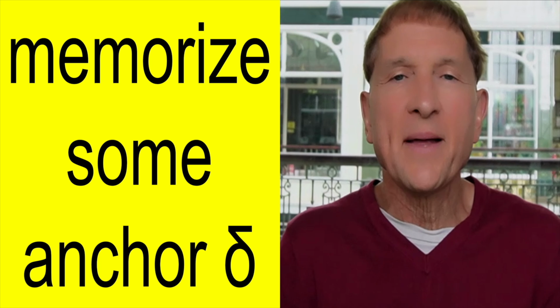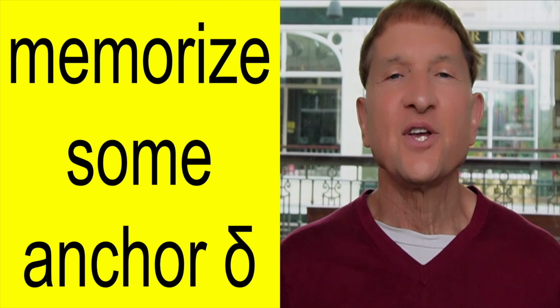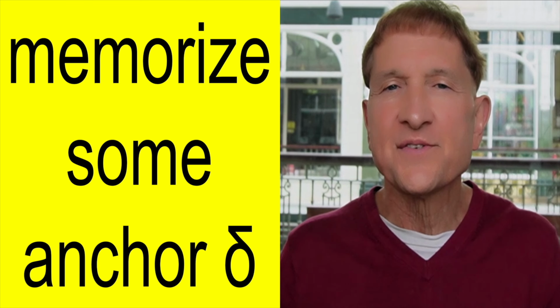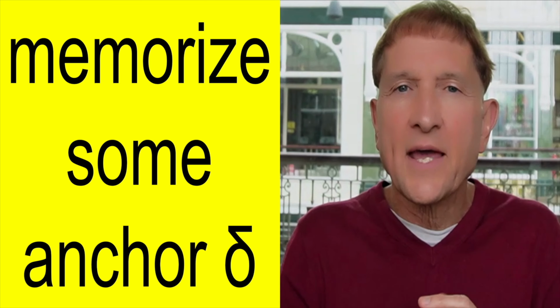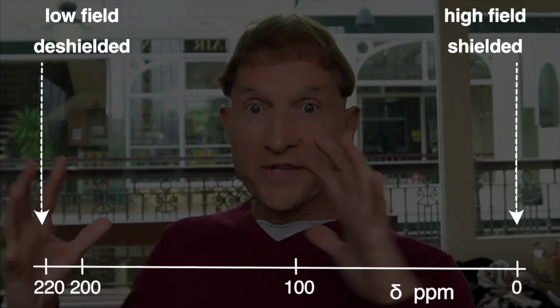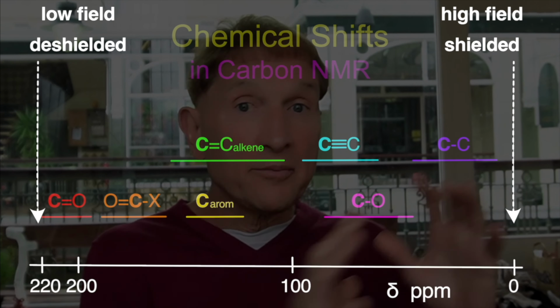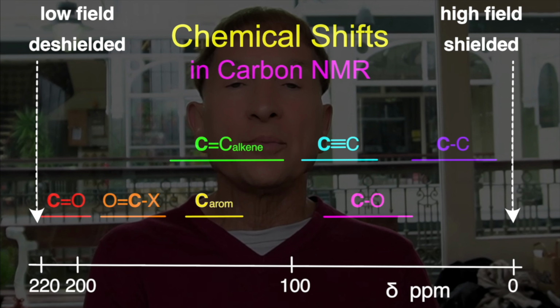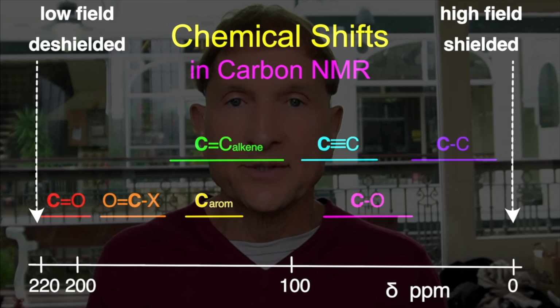No one can remember all possible chemical shifts. I suggest you remember just a few ranges. If you memorize these, you can learn to guess at other chemical shifts in the spectrum. Most downfield are carbonyl C=Os, and most upfield are aliphatic carbons with no electronegative substituents or alkenes attached to them.